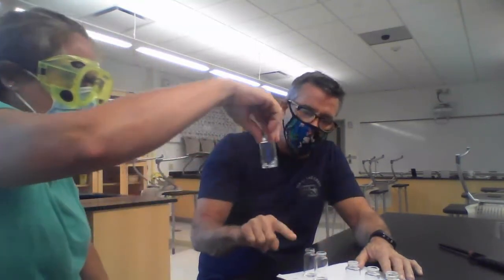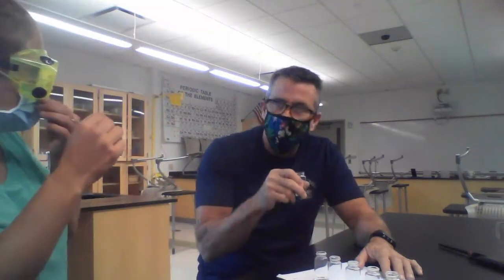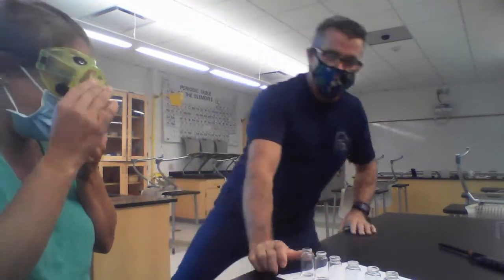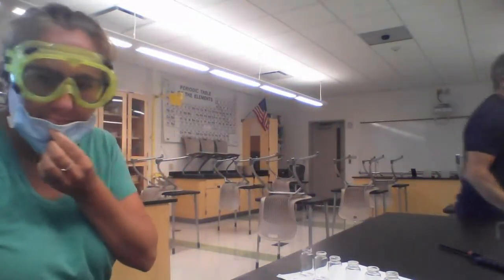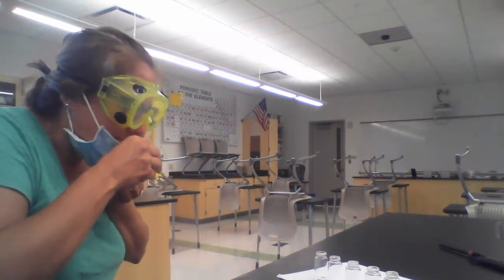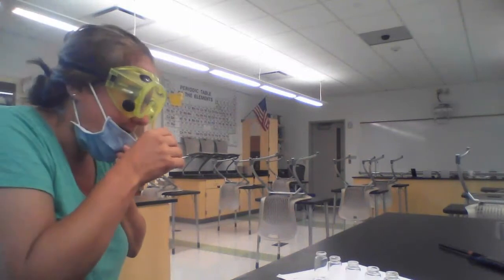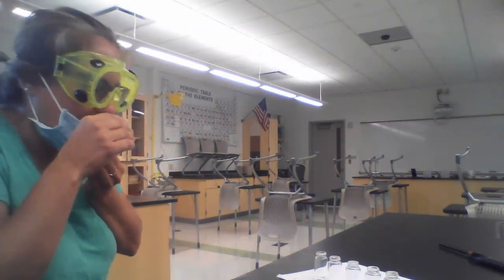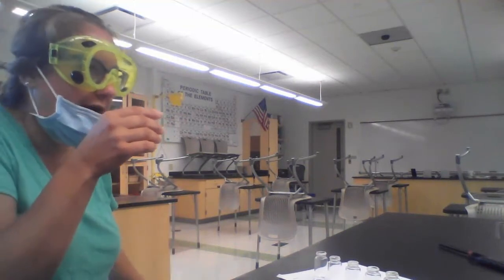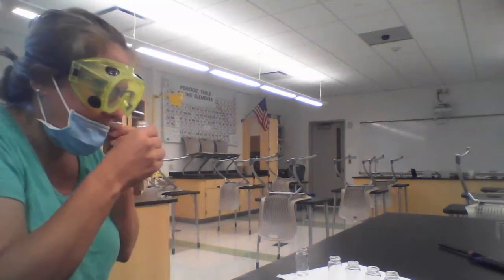Greasy. Now hold on, maybe what we'll do is, since I took a small, if you're willing to. Can I smell? Yeah, in fact, if you need the mask off, I'll get far away from you. And okay. She's going to take a whiff of each one, just a little bit safely. Ooh, this one would not be a water. This definitely has a distinct smell. You could use words like strong, sharp, sweet, sour. This is a strong alcohol smelly. Okay, number 1, strong and alcohol smell.